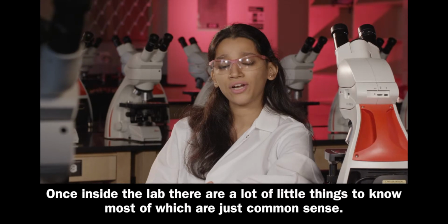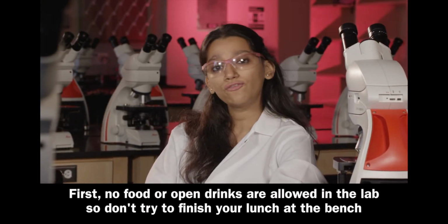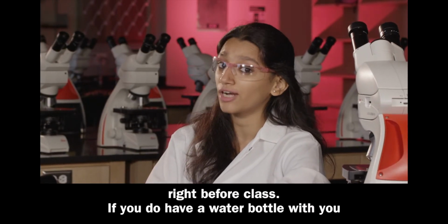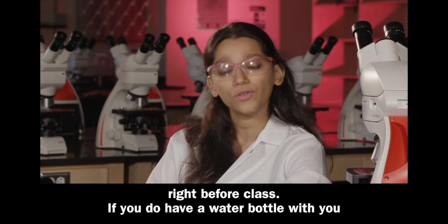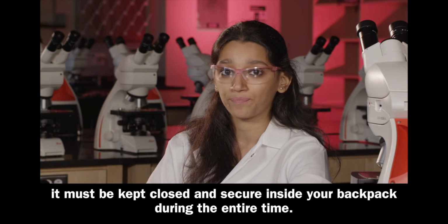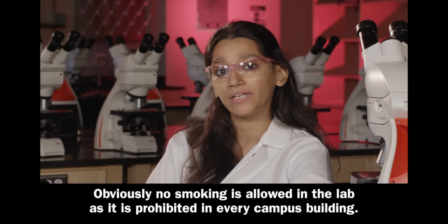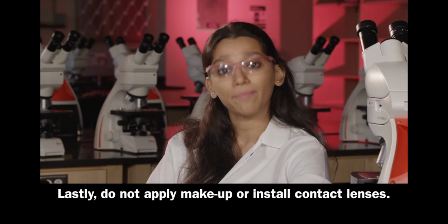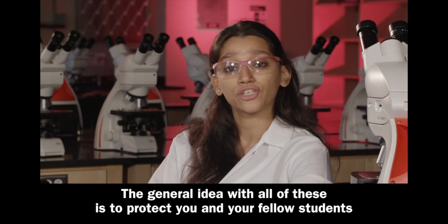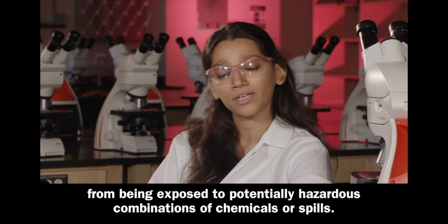Once inside the lab, there are a lot of little things to know, most of which are just common sense. First, no food or open drinks are allowed in the lab, so don't try to finish your lunch at the bench right before class. If you do have a water bottle with you, it must be kept closed and secure inside your backpack during the entire time. Obviously, no smoking is allowed in the lab as it is prohibited in every campus building. Lastly, do not apply makeup or install contact lenses. The general idea with all of these is to protect you and your fellow students from being exposed to potentially hazardous combination of chemicals or spills.